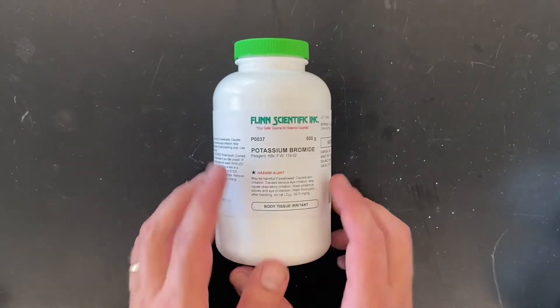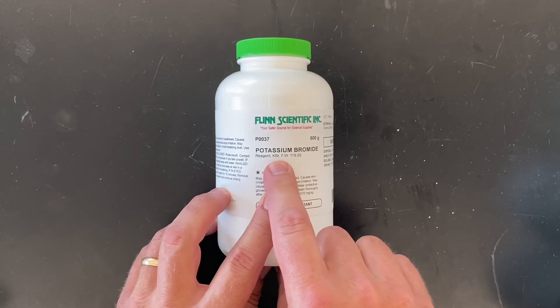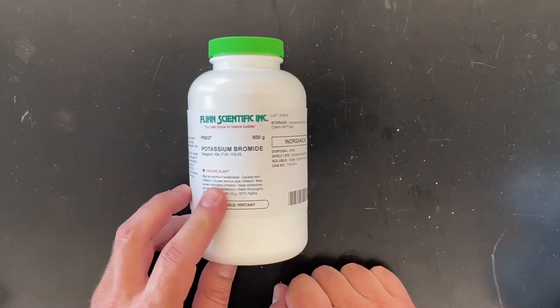Some potassium bromide, which we'll use for a couple of demos this year. It's just potassium and bromine, with a formula weight of 119. That's a 500 gram bottle of that as well.